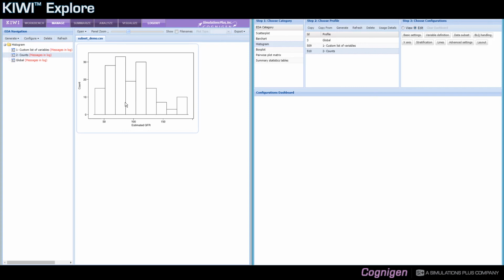You need to set a little bit more fields than a histogram, but you will get additional information such as the actual count for each bar, and will also give you some cumulative counts and percentages overall. So you get a little bit more information using a bar chart when you really want to have access to a count or frequency of records.